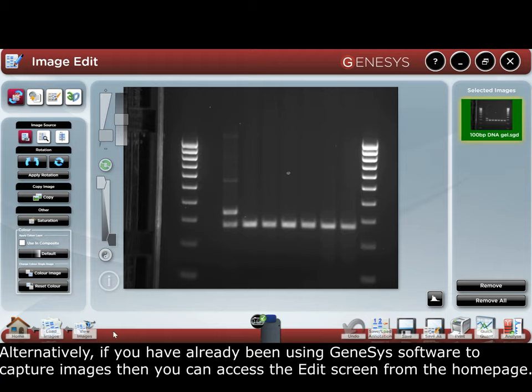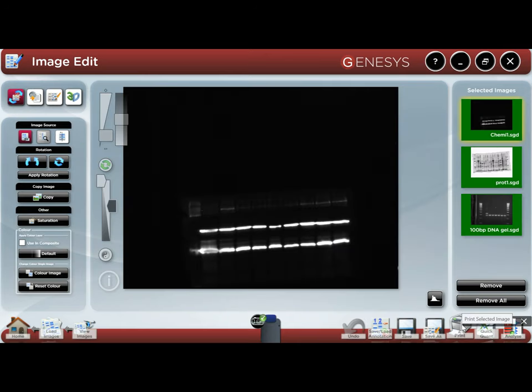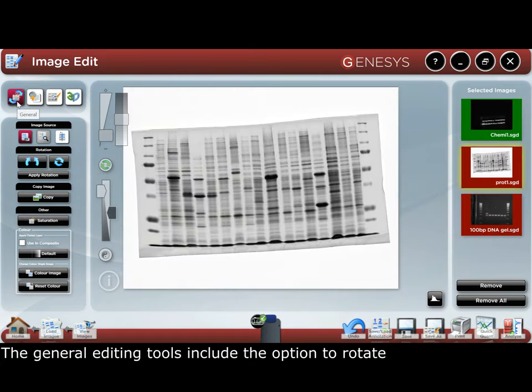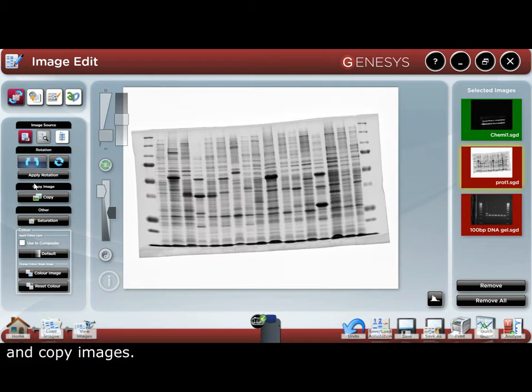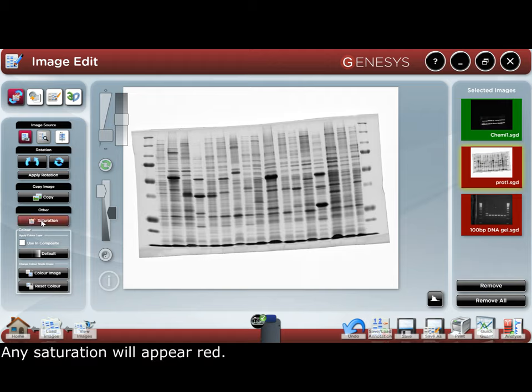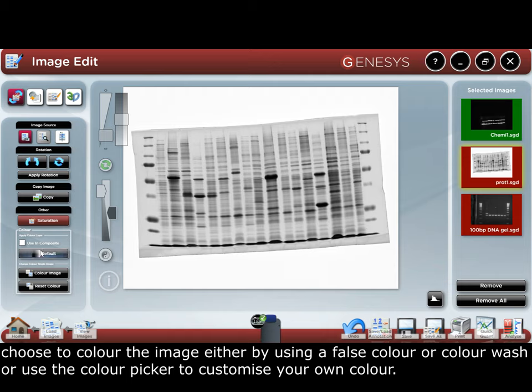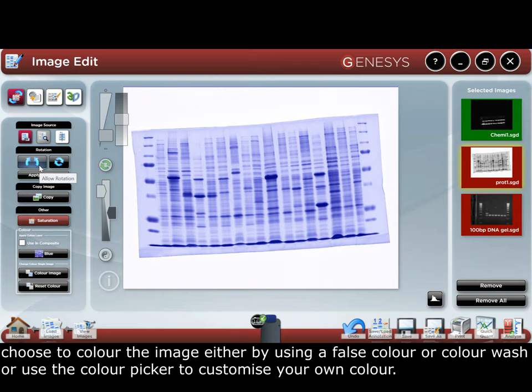The general editing tools include the option to rotate and copy images. To ensure your image is not saturated for quantification purposes, any saturation will appear red. Choose to color the image either by using a false color or a color wash, or use the color picker.